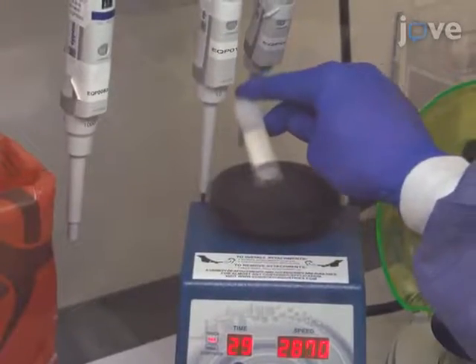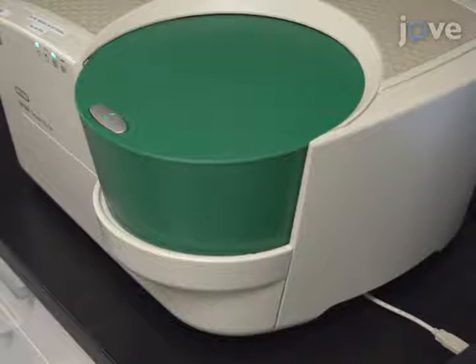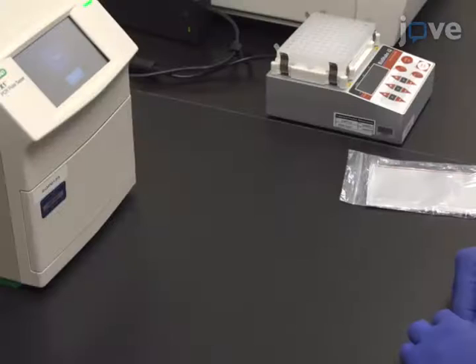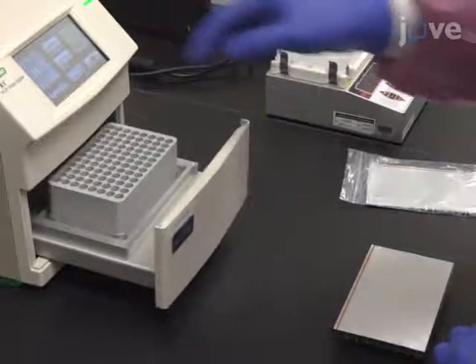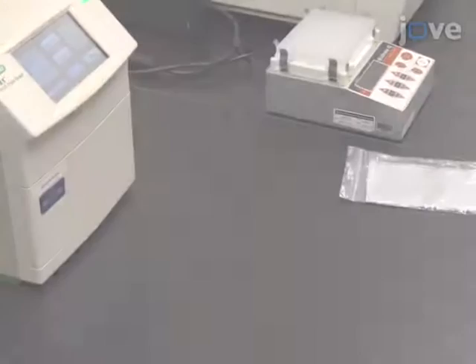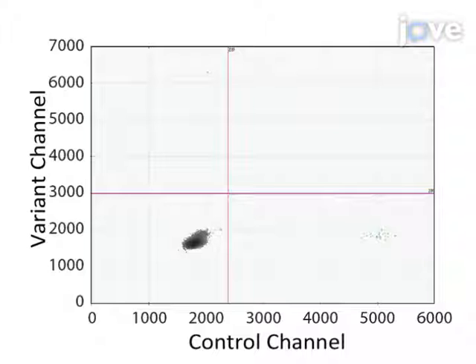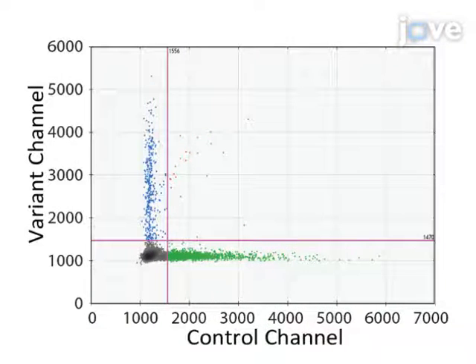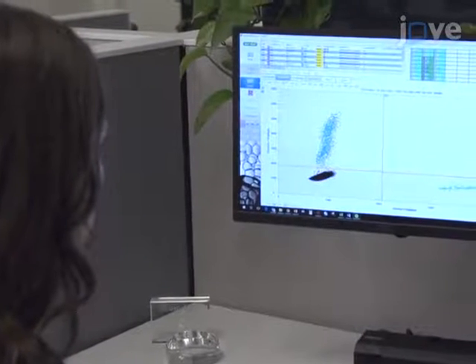The main advantage of this technique is that it uses highly optimized methods for the stabilization, extraction, and detection of RNA variants present at low frequency in blood samples. Blood-based testing is a complement to traditional tissue biopsies with the benefit of utilizing a minimally invasive technique that can provide rapid results. Although this method can provide insight into clinically significant mutations in NSCLC, it can also be applied to other systems where the accessible and rapid identification of circulating RNA molecules in whole blood is needed.